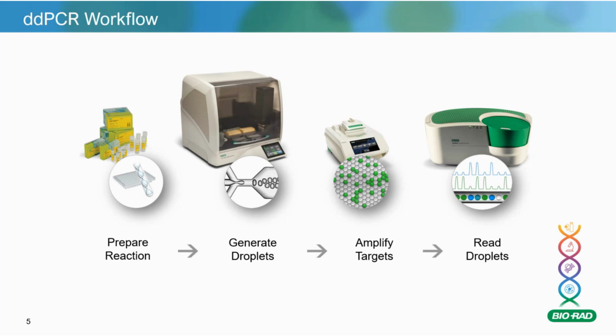In other digital PCR technologies, many of them will use a single camera and take a picture of all 20,000 on a full plate, or that can only go to 16 normally. So on a 16-well plate or a 24-well plate, and that's all looked at once. Obviously, when you do it that way, you're running into a bit of danger of things like crosstalk between channels and other issues that may occur.